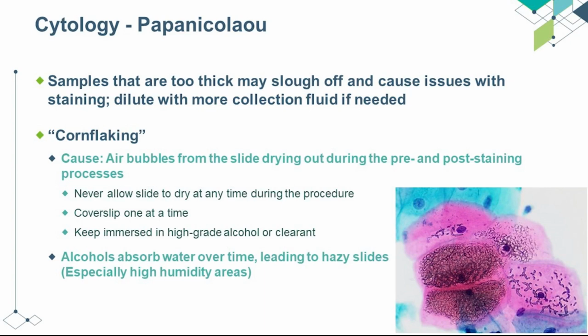If you clear 5 to 10 slides at a time and pull them out and cover slip, the last couple of slides will have sat in the air for longer than suggested and may exhibit this cornflaking. And again, remember the alcohols pull water out of the air, so it's important that your final dehydration alcohols are kept fresh or tightly sealed between usage. Otherwise, your slides, especially with this stain, may appear hazy under the microscope.